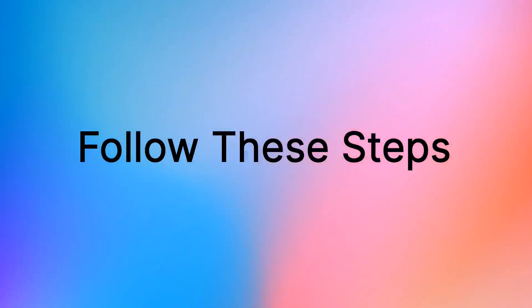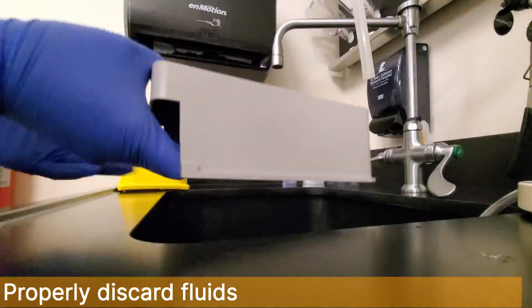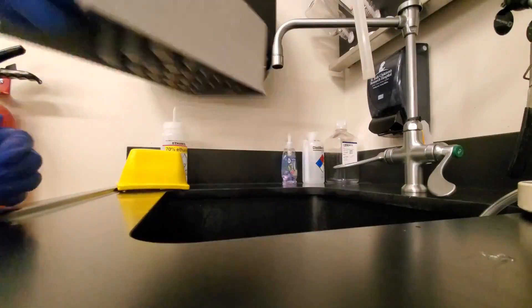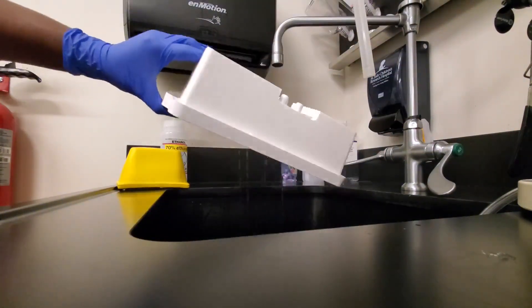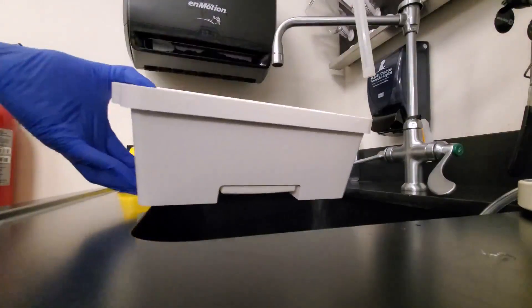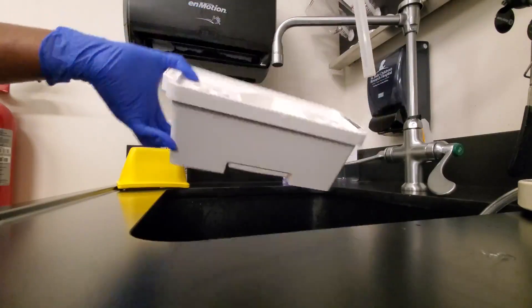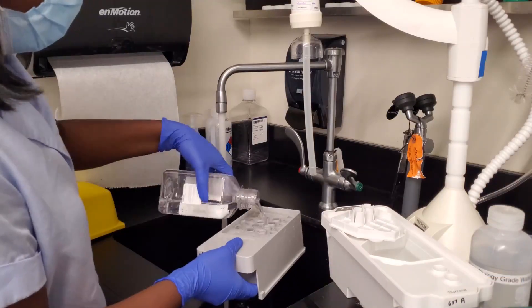Follow the next steps to clean your cartridge. First, after removing the wash cartridge from the instrument, properly discard any remaining wash solution. Thoroughly rinse each position of the wash cartridge with warm water.